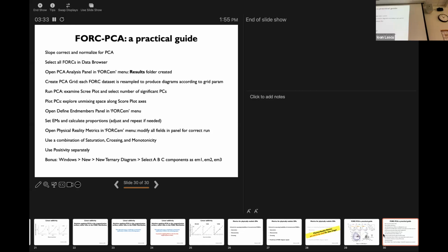Is there a particular reason you asked the question, Bruce? Okay. Well, we did it because we were trying to explain the coercivity components from IRM acquisition curves or DC demagnetization curves. So we needed an equivalent type of map, so not a FORC map, but a remnants map. So kind of. Oh, go ahead. Please, I'll talk over you with this microphone.